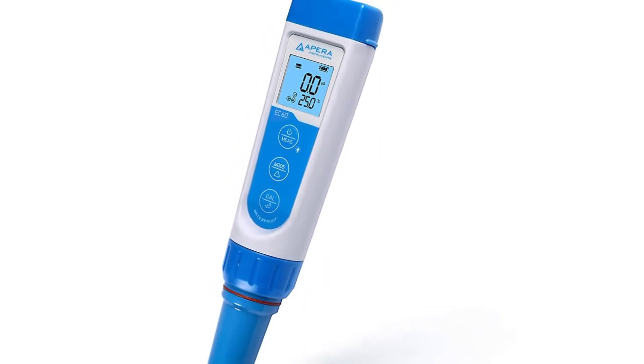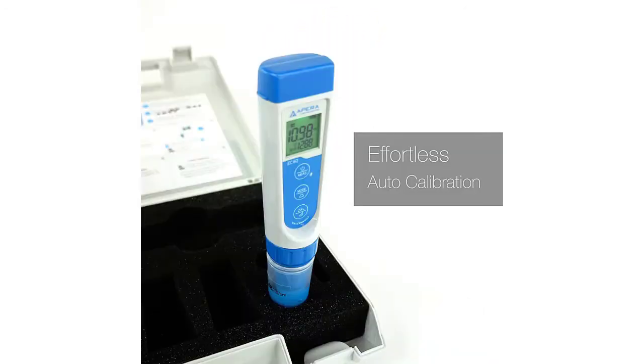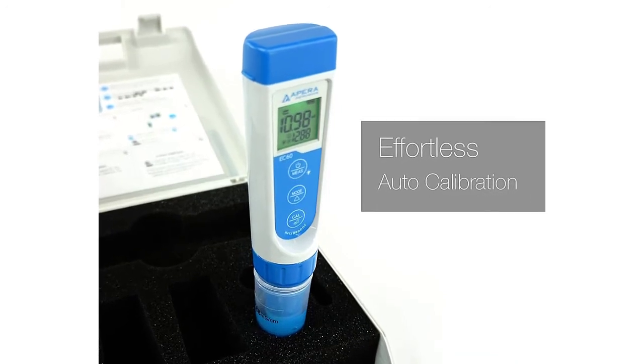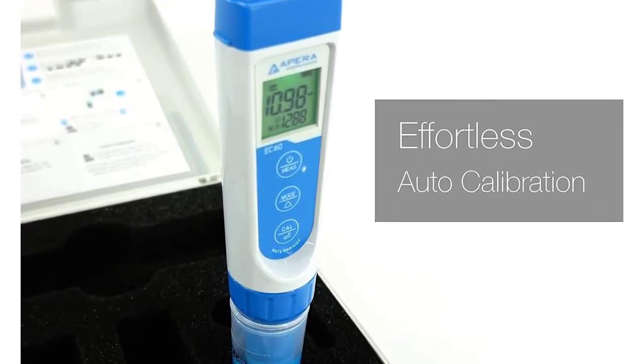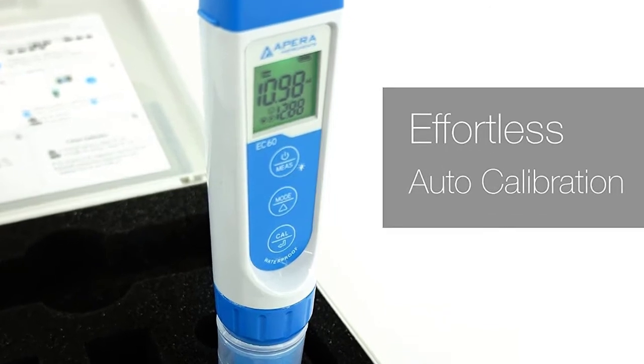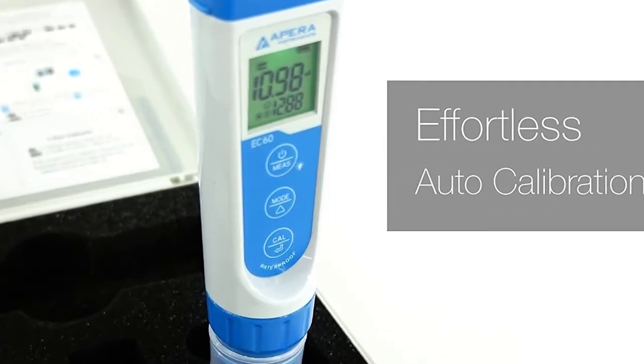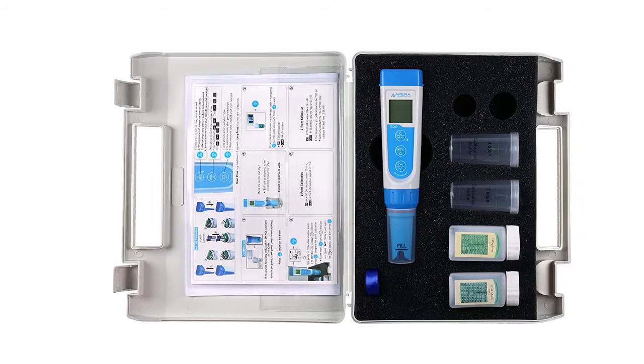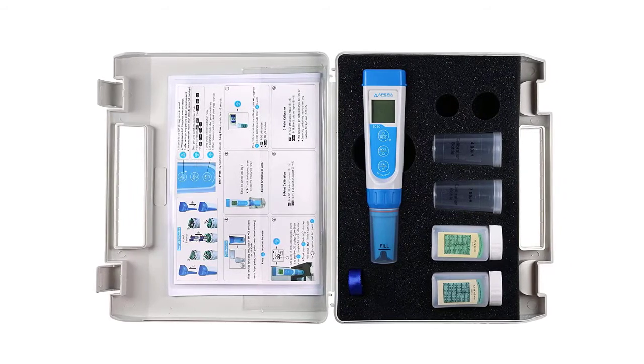Professional TDS, EC, and Temperature Pen — a 3-in-1 device. Upgraded with a big backlit LCD for easier reading and an auto-lock function for easier use. Just turn the TDS meter on, stir the water gently, and stabilized readings will be auto-locked on the LCD in seconds.